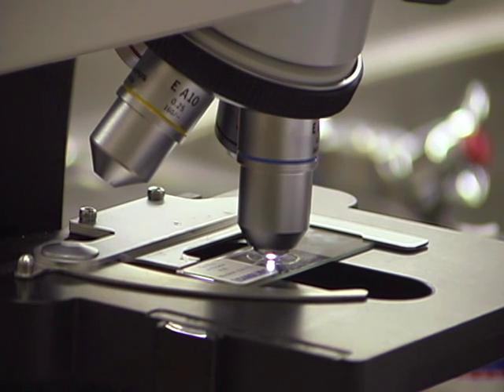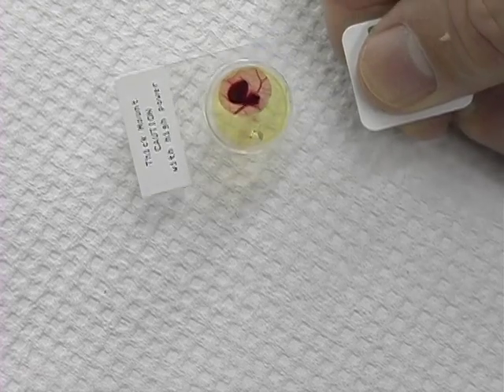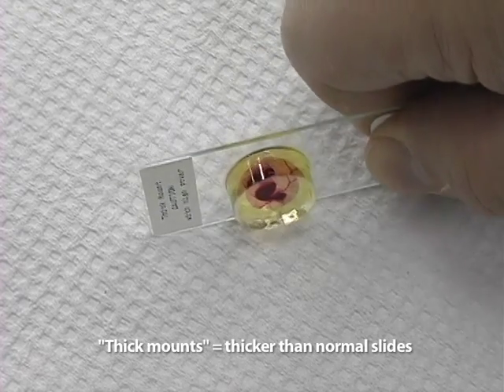Today's microscopes are usually designed so that the highest objective lenses cannot break regular slides. However, at higher magnifications, it is possible to break thicker slides. Such slides are usually called thick mounts.